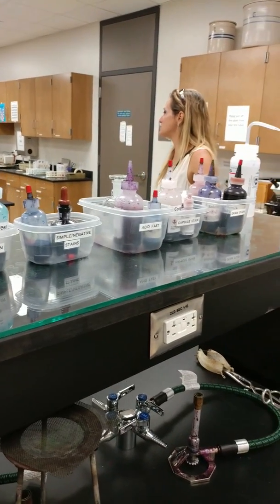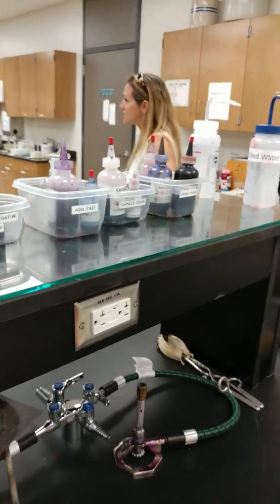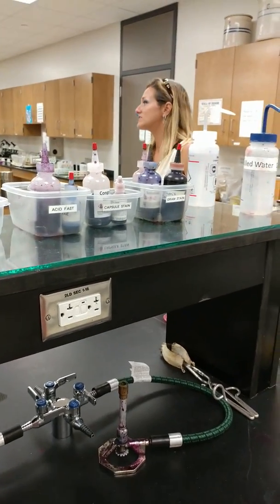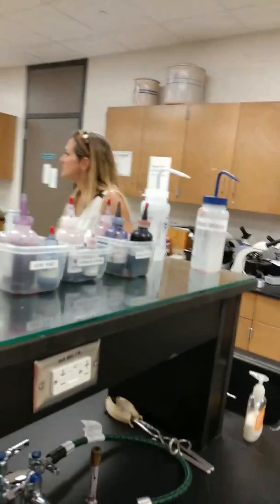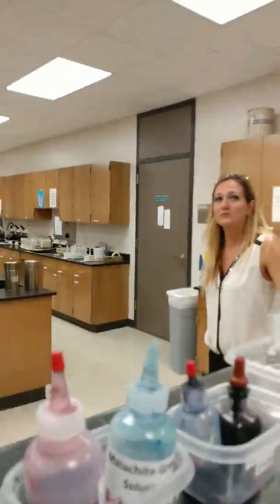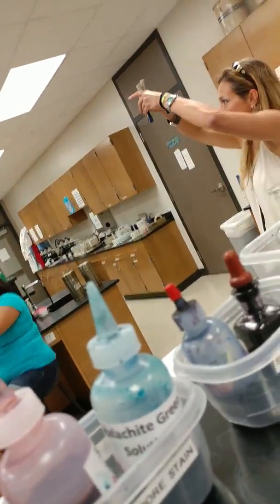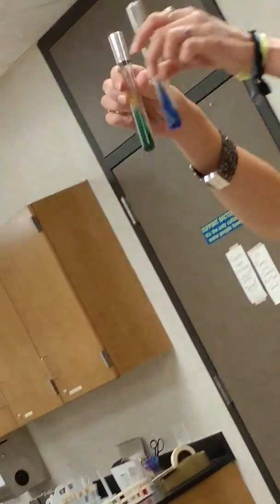This test is my favorite because it's the prettiest, and in honor of spring today, I call this the Earth test, because what color does the Earth look from space? Green and blue. So yes, we are looking today at green and blue, and they're so pretty, I love these two.